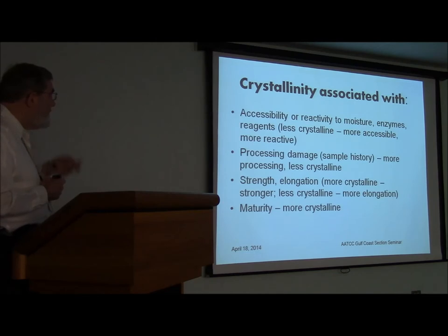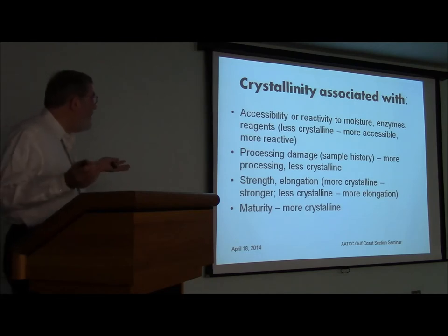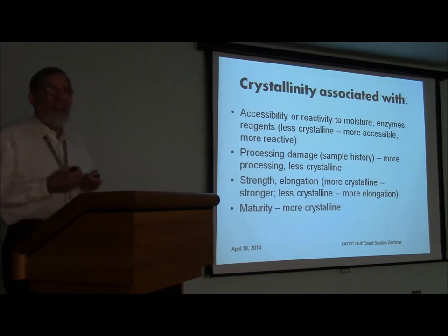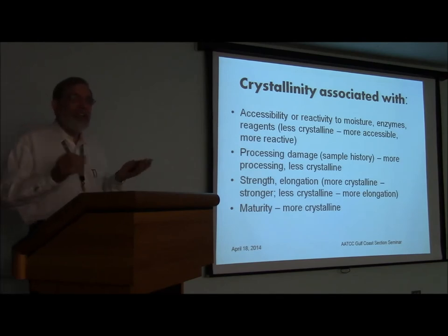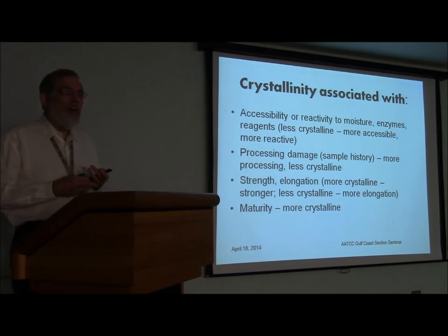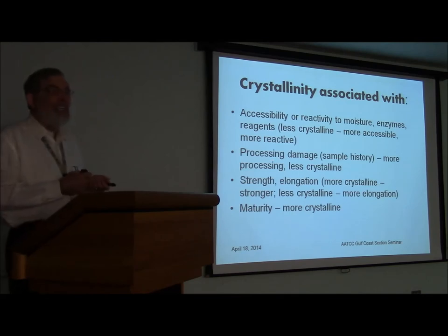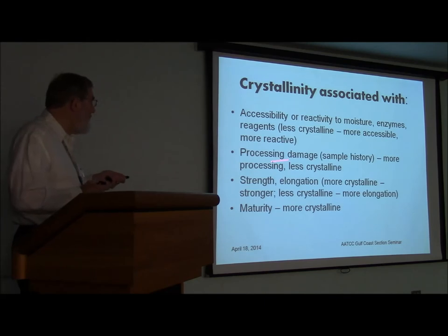So the crystallinity is associated with accessibility or reactivity to moisture, enzymes, reagents. The less crystalline, the more accessible and the more reactive things are thought to be. One of the things that Mike Reynolds was concerned about early on was whether the hydroentanglement line, jets of water under thousands of psi of pressure, was decrystallizing the sample. So we looked to see if there was any damage to the crystallinity of the samples by running it through hydroentanglement. We found that it wasn't.